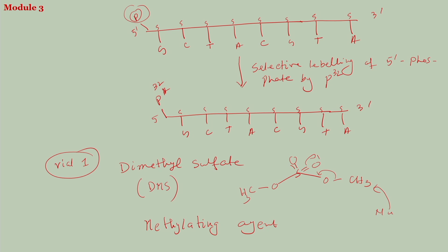So, methylation can be done, and this methylation is quite selective. It does not methylate all the nucleobases.